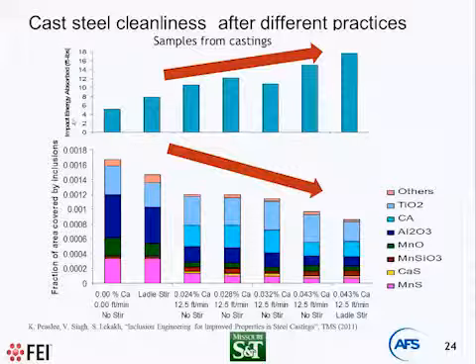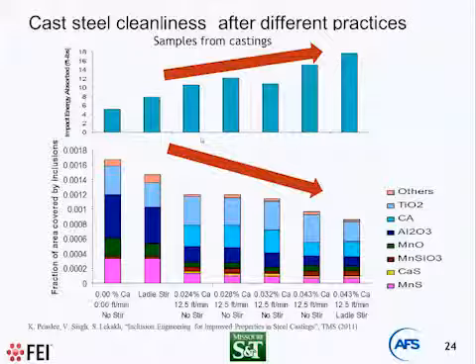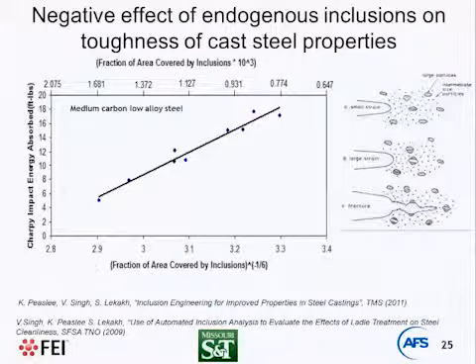Then Vinci collected samples from all of these heats, did heat treatment, and we started impact energy, Charpy tests at room temperature. And we definitely see a correlation between non-metallic inclusions and Charpy toughness in this steel. When she plots the area of non-metallic inclusions to the power minus 1/6 versus Charpy energy for all of these, you have an absolutely straight line.